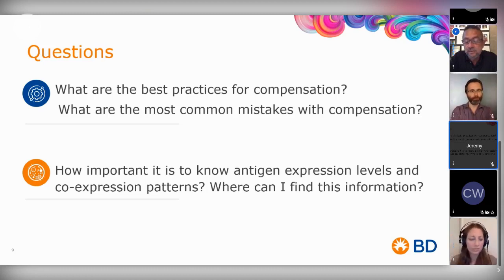And I think for many of us, we do know that there are tools today and applications that will allow us, utilizing PE as a color, to do some quantitative work on the surface of the cell to determine the numbers of antibody binding or antigen binding properties of a specific cell. And there are several different places in the world where that type of technology can be obtained.